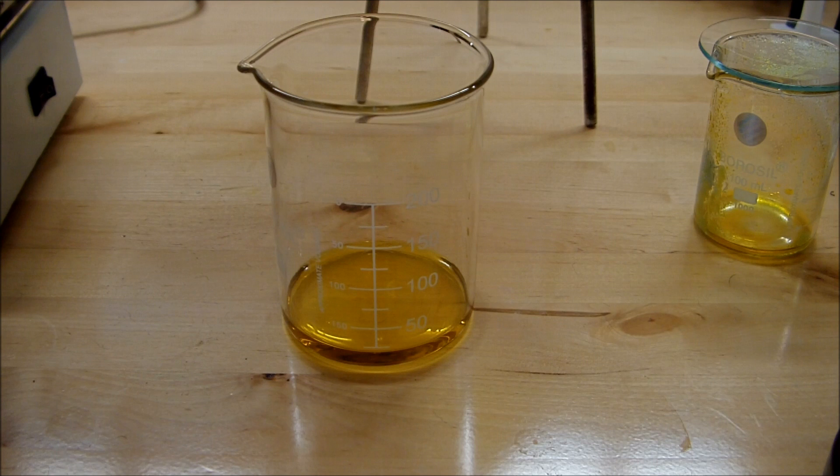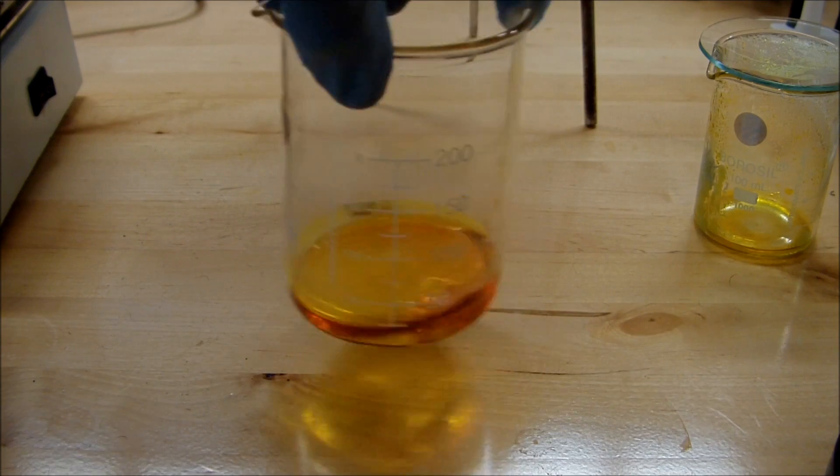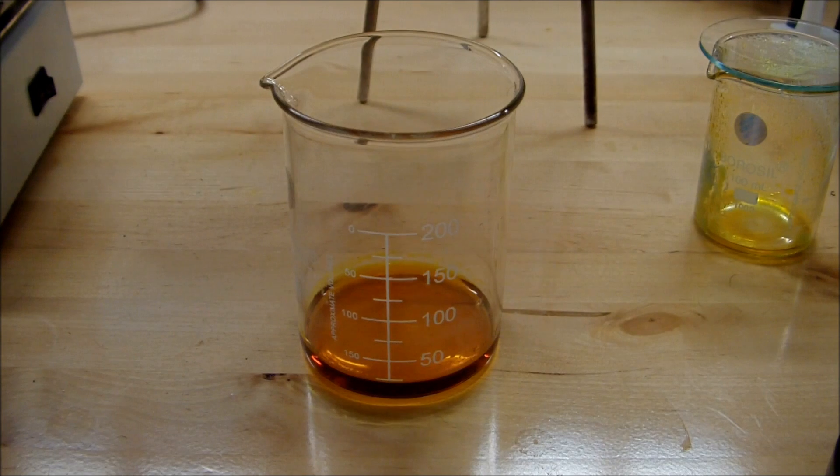Another way that you can speed up this conversion if you want to is by adding a little bit of hydrogen peroxide to introduce oxygen directly to the solution. And that's what I'm going to do right here. You can see it immediately begins to get even darker as iron 3 chloride is produced.